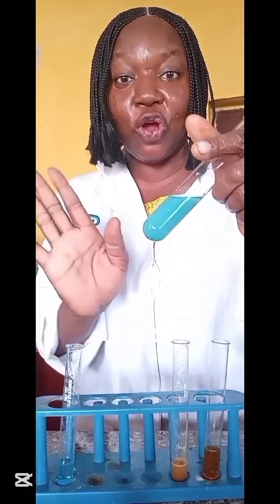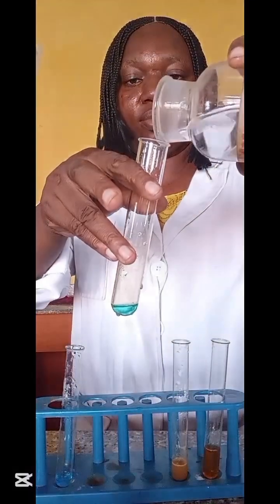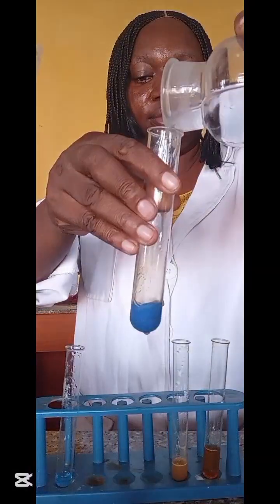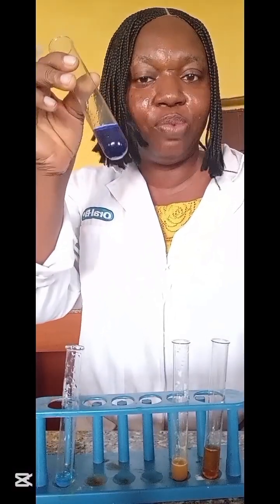The precipitate does not dissolve. That's copper 2 ion. Let's try it with ammonia. So it's still a pale blue gelatinous precipitate. Then in excess, it dissolves to give a deep blue solution.